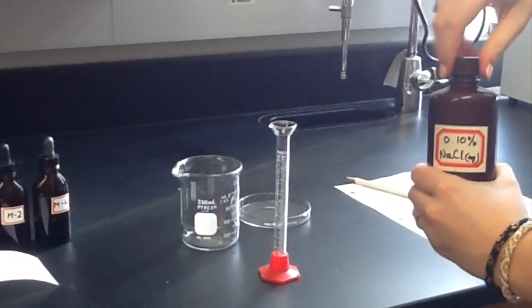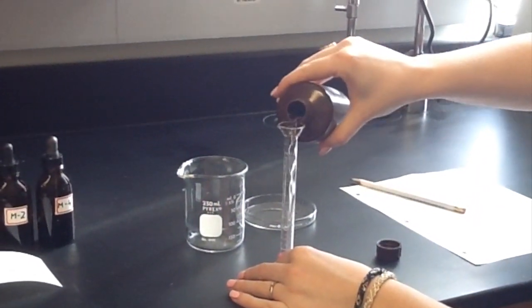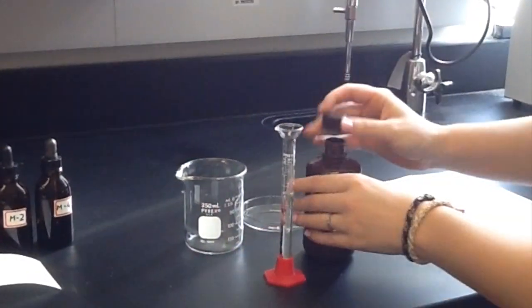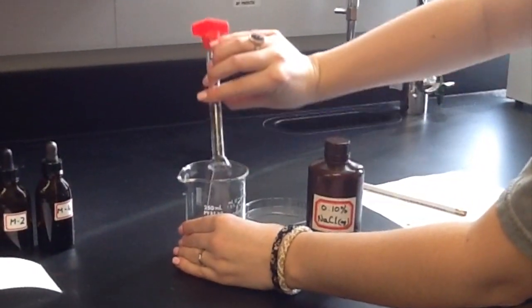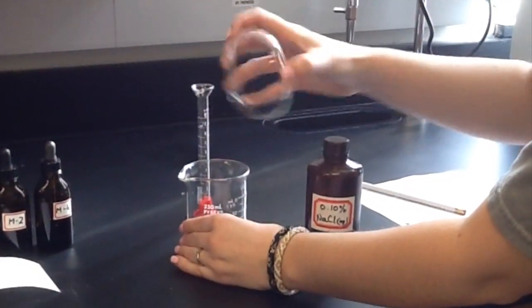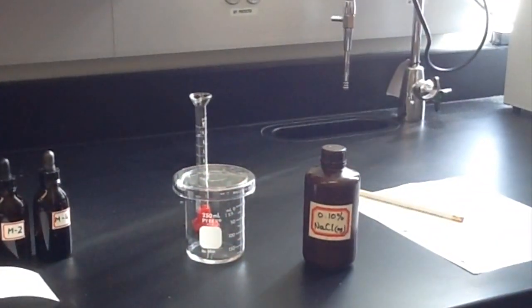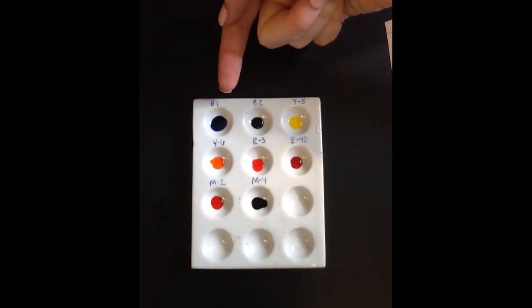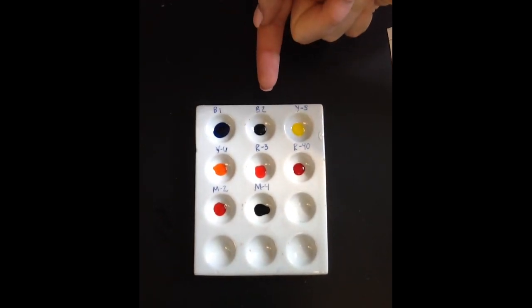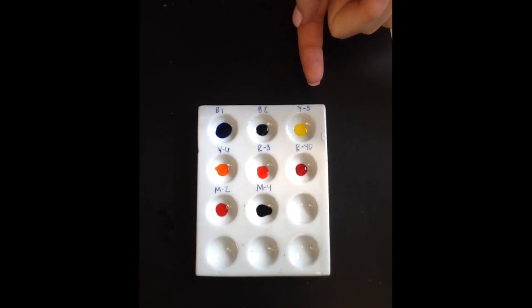Using a 10 ml graduated cylinder, measure 7 ml of your solvent and carefully transfer to a 250 ml beaker. Cover the beaker with a petri dish. Using a spot tray, label each well with the specific dye and transfer a drop of each dye into the corresponding well.